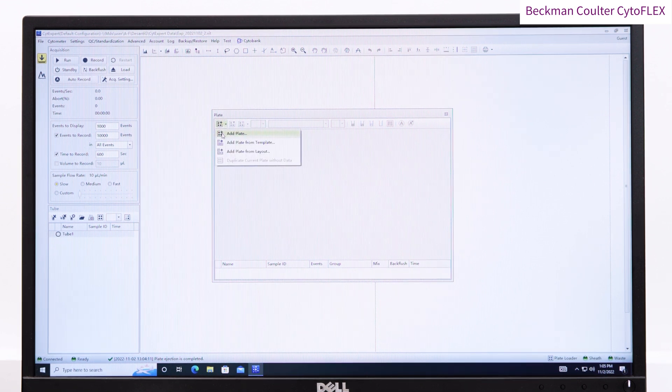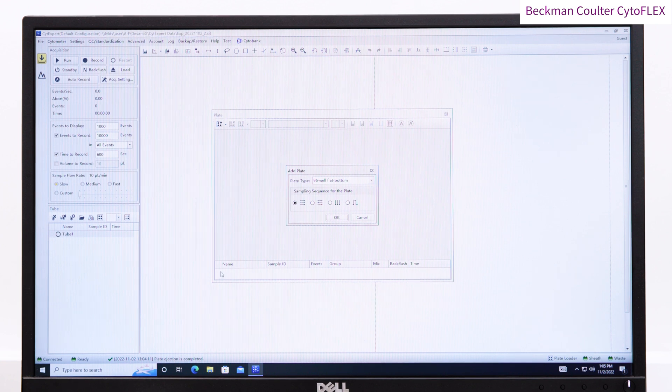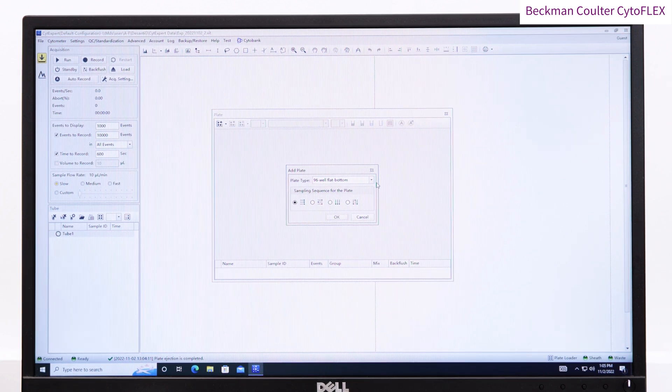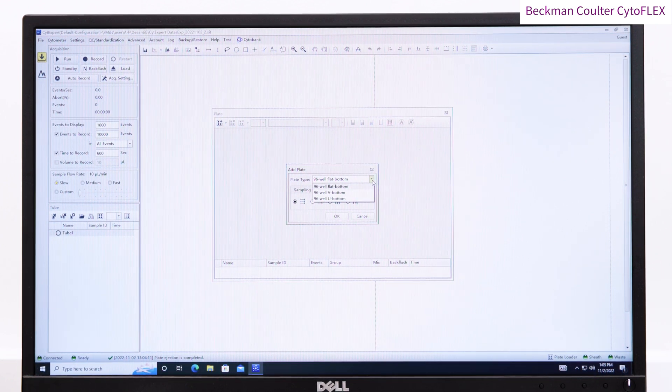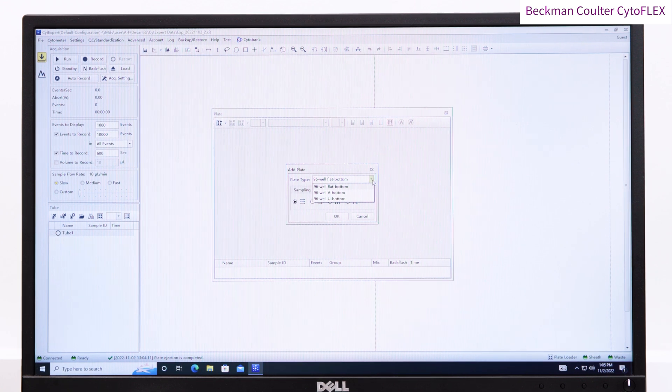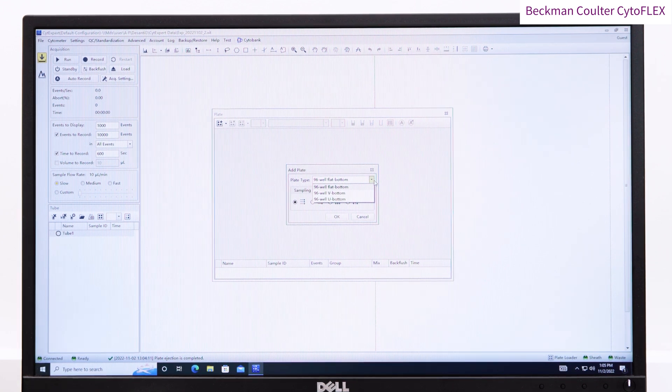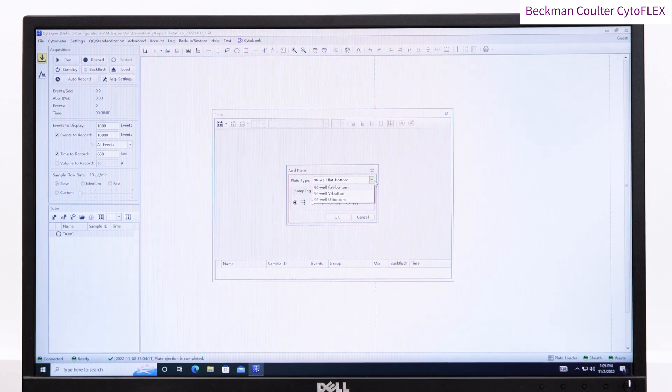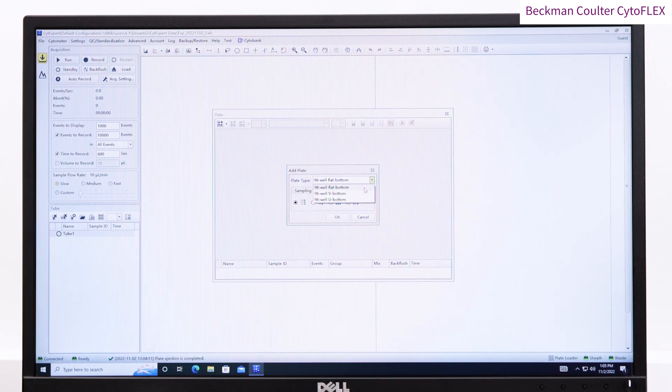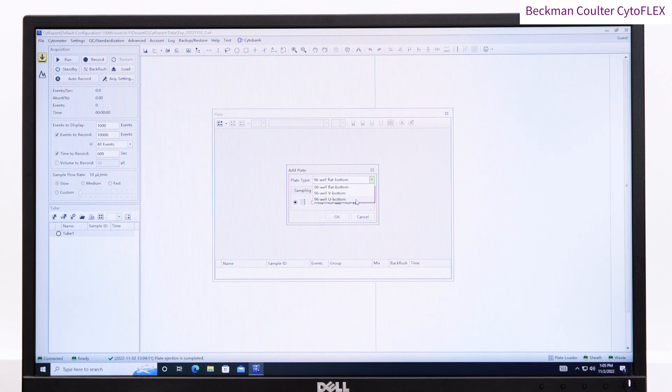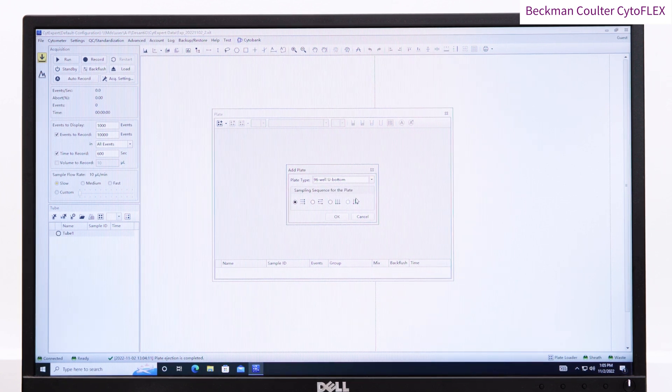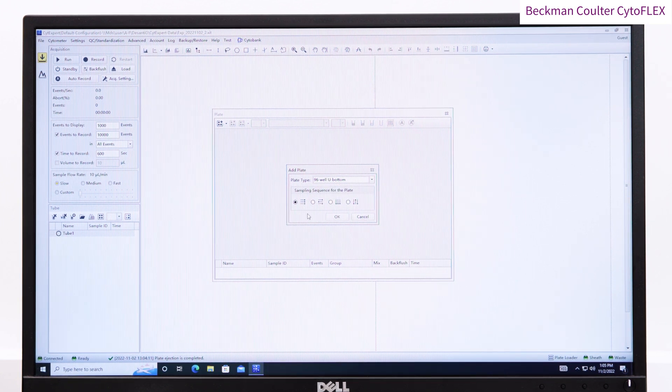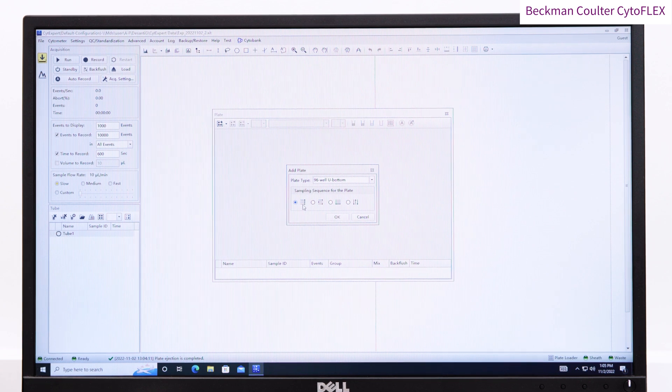You can then define the plate by selecting wells and naming them, or adding common prefixes such as the single stain controls here. The acquisition settings loaded as default are controlled by the administrator of your machine, and typically cover a very large range of samples. If you are doing small particle analysis, or very bright stains, you may need to adjust these settings.